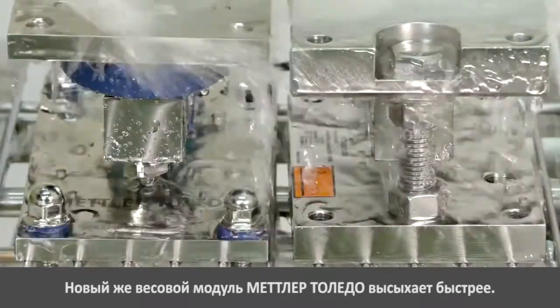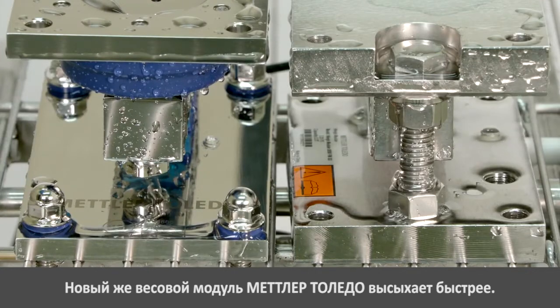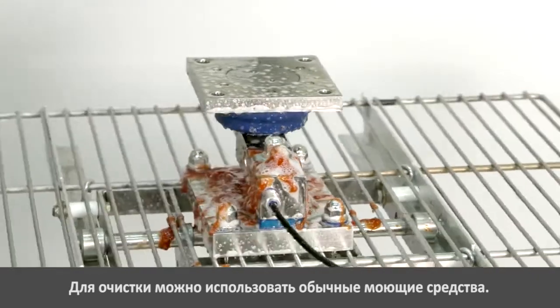The new weigh module from Mettler Toledo dries faster than a traditional weigh module. The weigh module can be cleaned with the usual cleaning detergents.